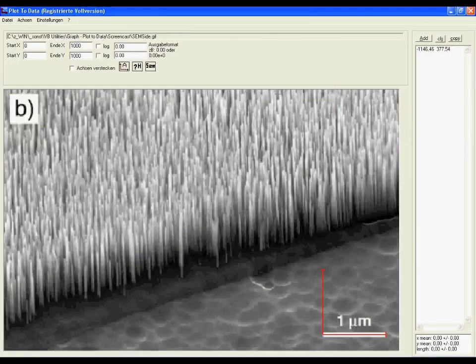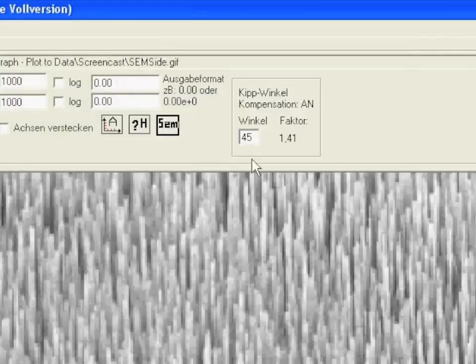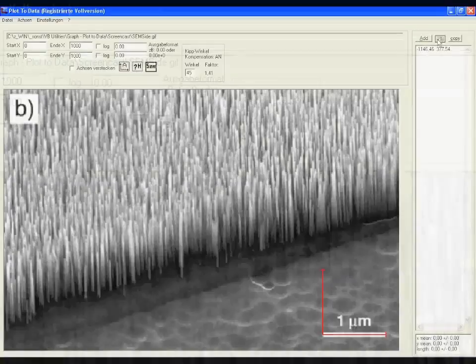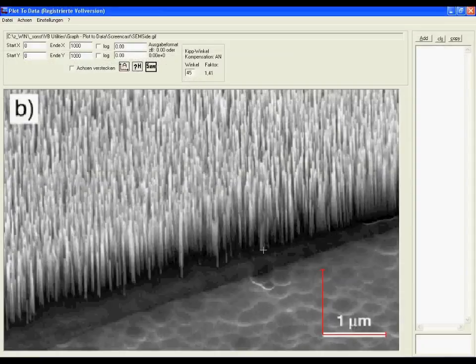Another good example of the program is the SEM mode. If you have a tilted sample like this one and you know that the tilt was 45 degrees then you can type in the tilt here. 45 degrees and then you will have the tilt compensation and you can measure height properly.